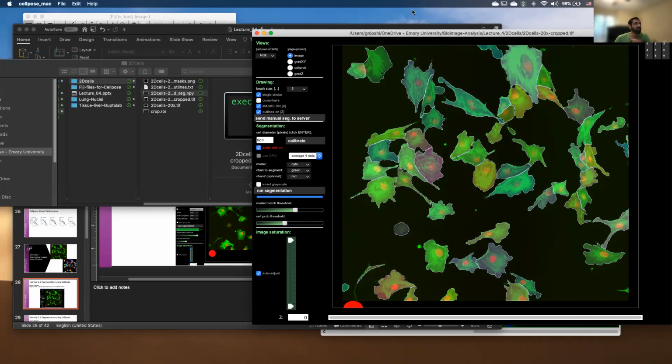And once you are happy with this, you can do a few things. Let me annotate this real quick to show you what I'm talking about. You can see right over here, I don't want this. This is not of my interest. These two cells right over here, actually this one cell appears as two cells.